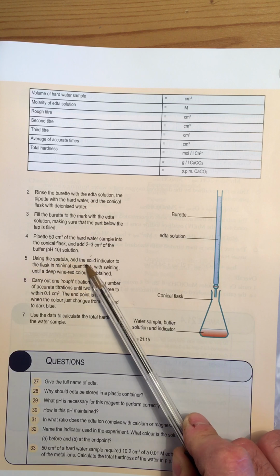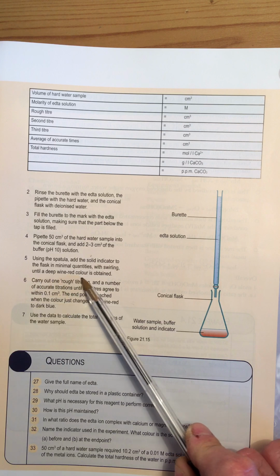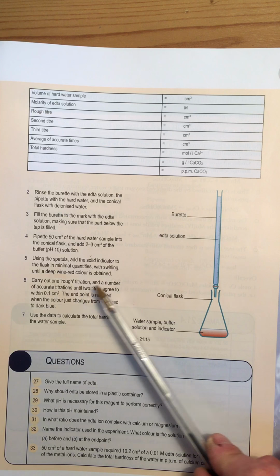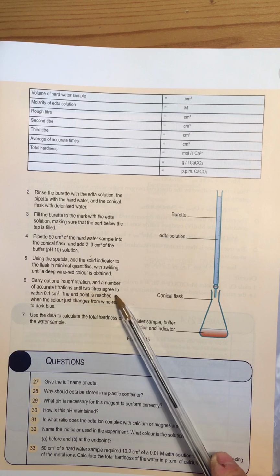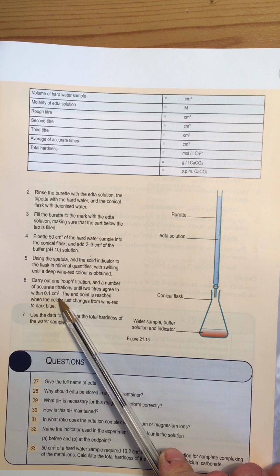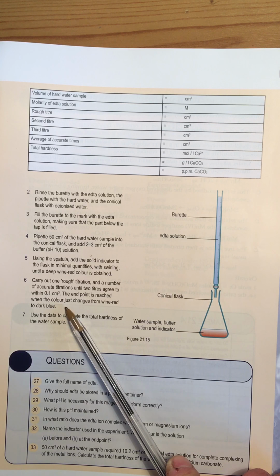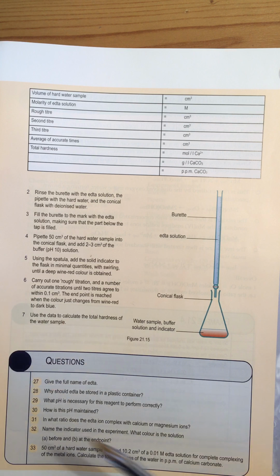Using a spatula, add the solid indicator to the flask in minimal quantities with swirling until a deep wine red color is obtained. Carry out one rough titration and a number of accurate titrations until 2 titers agree to within 0.1 of a mil. The end point is reached when the color just changes from wine red to dark blue. And then use the data to calculate the total hardness of the water sample.